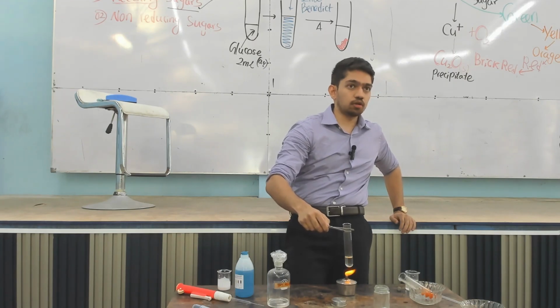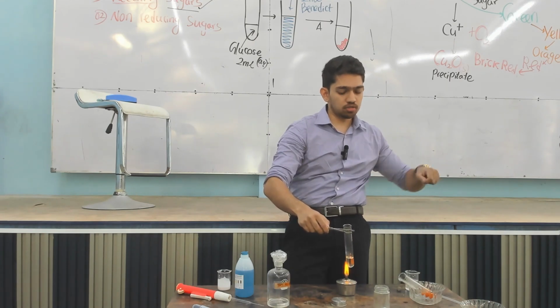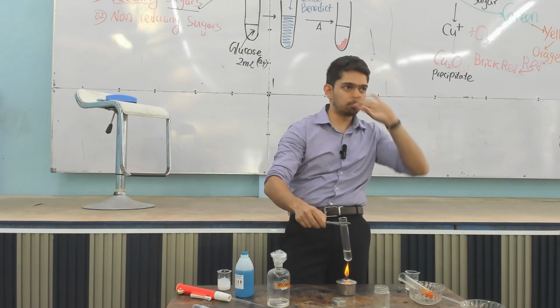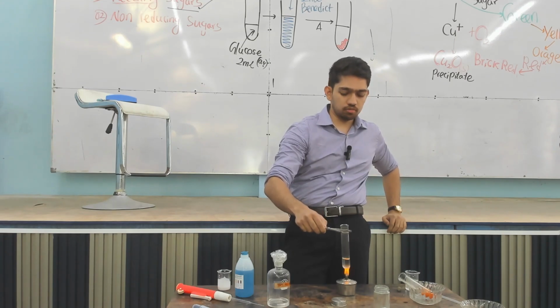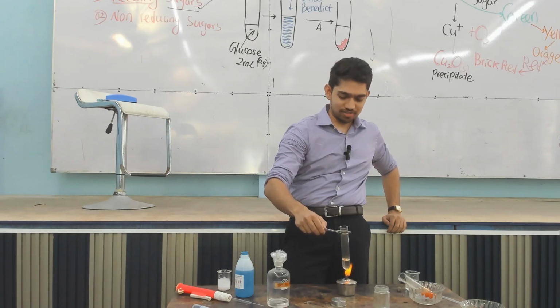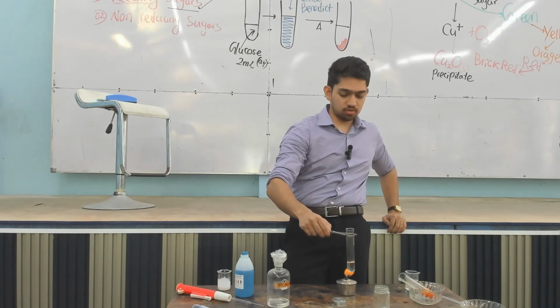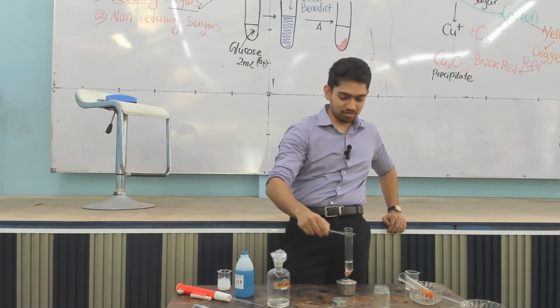So always in our labs, girls, when you are going inside, because we have Bunsen burners, the flame can become very big, right? So you always have to have your hair tied, because hair can catch fire very fast, okay? If it catches fire, there's nothing more to do, right? All we can do is use a fire extinguisher, okay? So all the girls should have their hair tied before going to the lab. On the first day of the biochemistry lab, we give a lecture, these are the basic safety principles, okay?